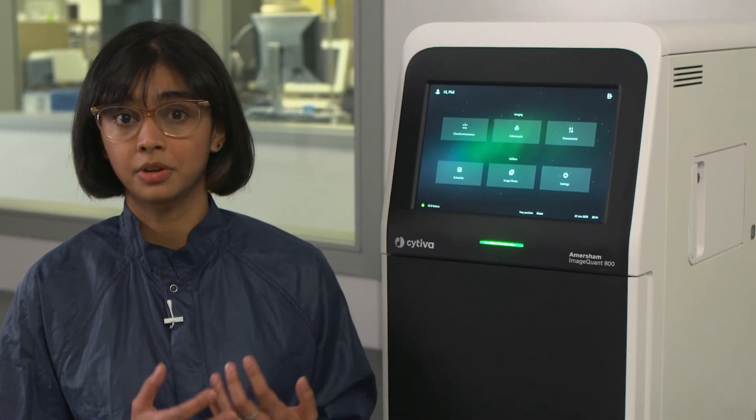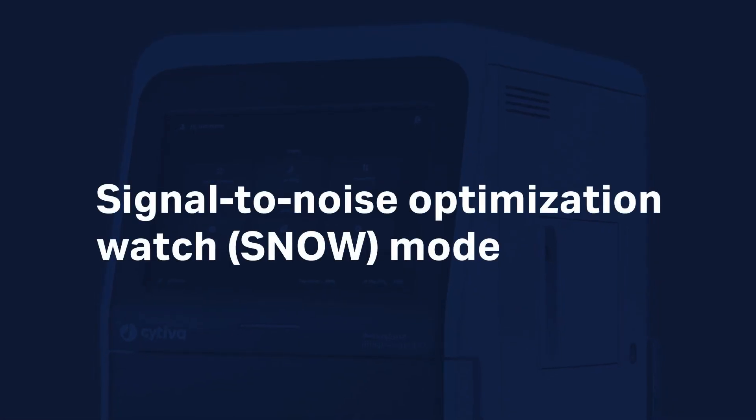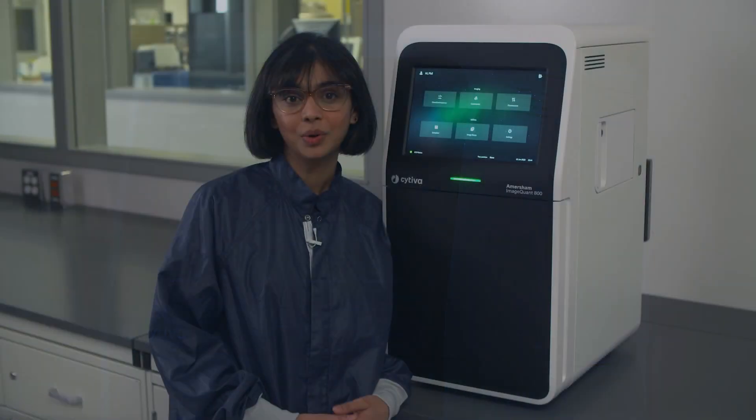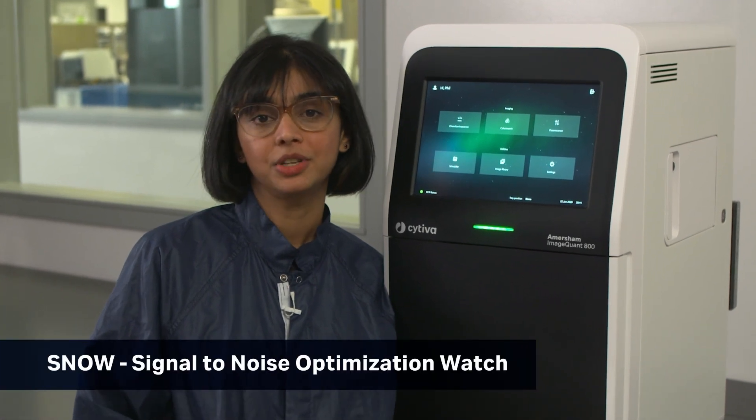It also comes equipped with a fully automated exposure mode called Snow, which extends the dynamic range of the system. In this session we will talk about this new and innovative detection mode called Snow on the ImageQuant 800.